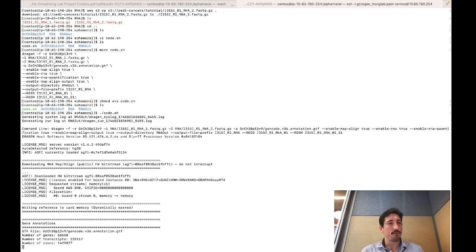I tend to not really save these as these are very large and you don't really need them to perform basic RNA-Seq analysis. The only thing I can think of to save the BAM files for would be if you're wanting to do some sort of isoform expression analysis. However, we're only sequencing here to 20 million reads, which is not sufficient to be able to capture isoform expression. You would need to go up a little bit higher, maybe 50 to 100 million reads.